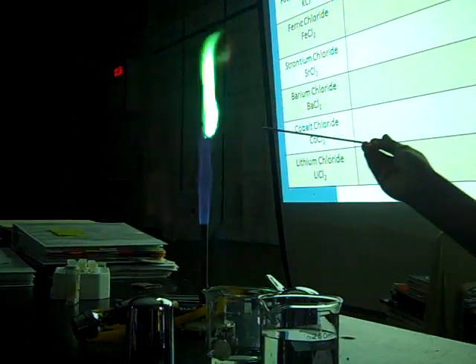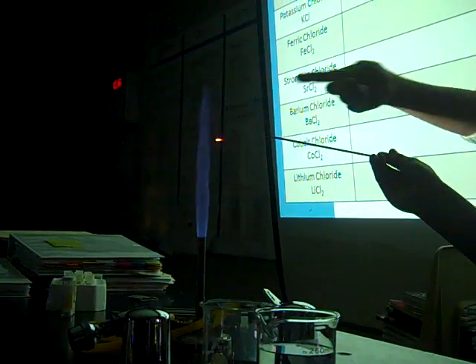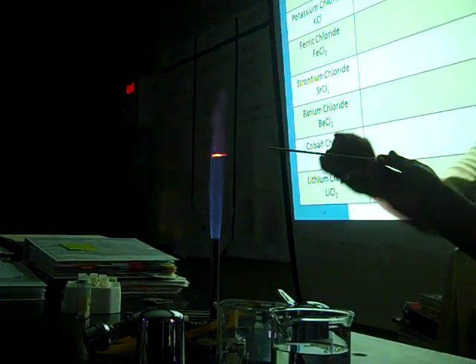Stick it in the flame right about here. That's awesome! Oh my gosh, that's so cool. Alright, so when it goes back to orange, we know that we've burned off everything. Okay? So let's do it one more time.